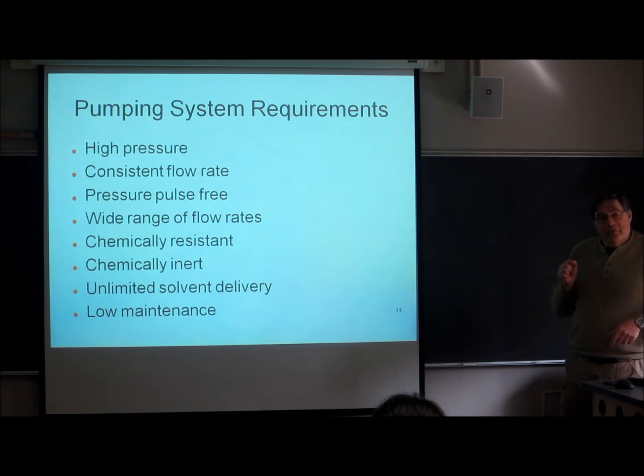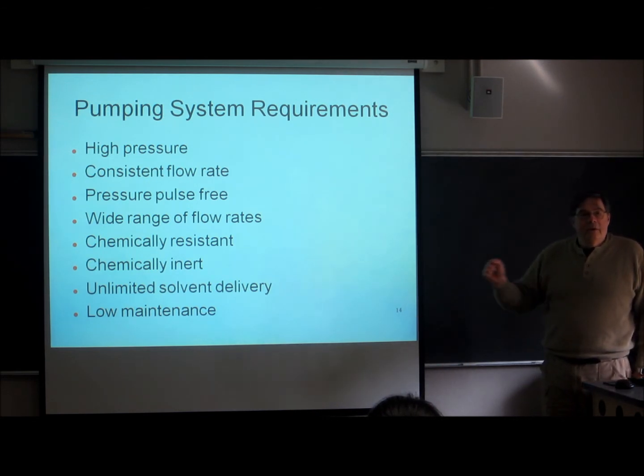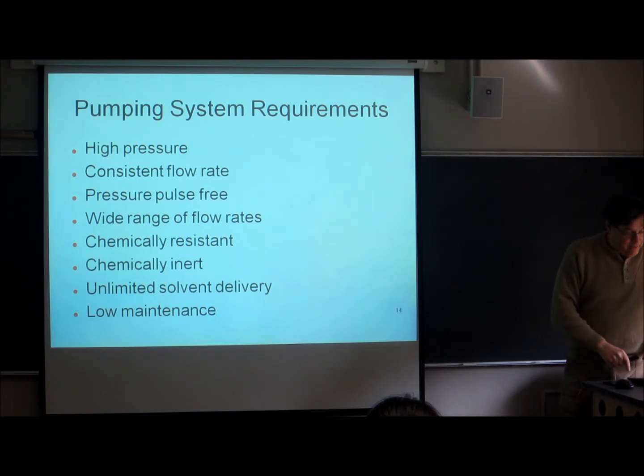Every pump that is a reciprocating pump, like the ones you're going to be seeing here with a piston that moves in and out, has the ability to create a pulse. And what we have to do is dampen the pulses by using both multiple pumps and by using pulse dampeners.